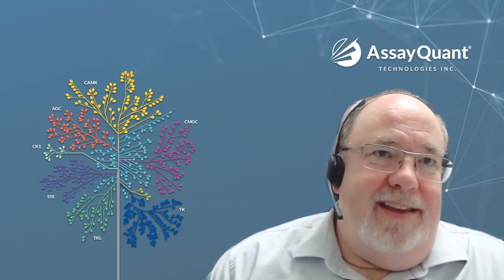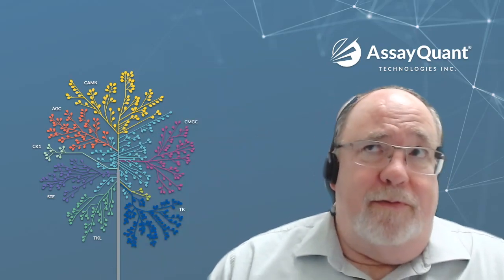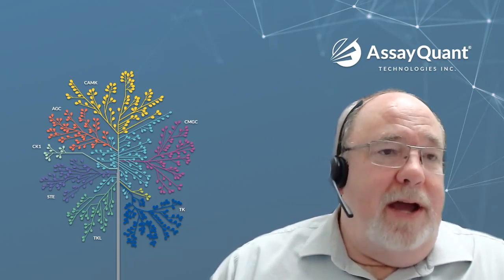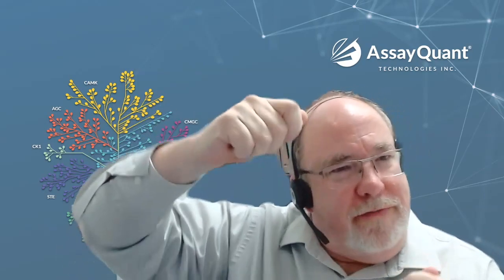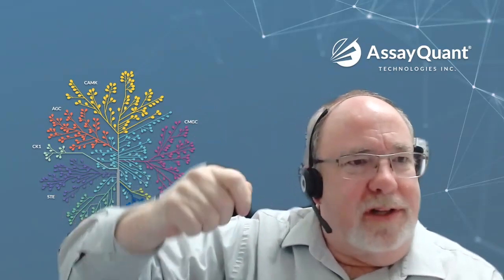You have to realize there are so many progress curves, because all of those are done in duplicate for kinome profiling for 400 enzymes and seven compounds per plate. You do the math. If you had to eyeball and pull out your ruler old school and find the rate like people did in their biochemistry classes, you go blind.